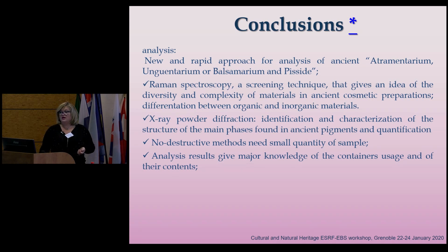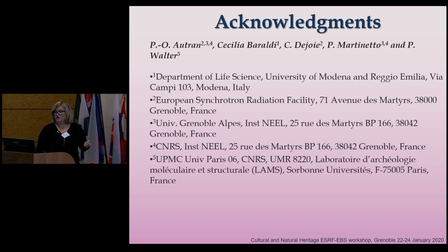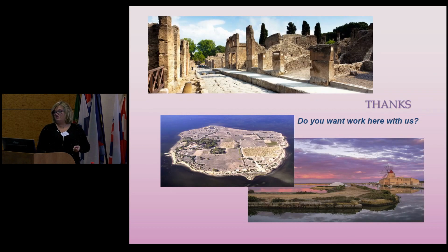These are non-destructive analyses, so the samples can be used for other analyses if we need, and we also have more knowledge about the holders and their containers. I have to acknowledge again all the people still working on the project. Other names are not written here because there were two other persons helping us. So I have to thank again Martinetto and Philippe Baltet, who asked me to come here, and Catherine, who worked a lot, and Pierre Olivier for the XRD pattern diffraction. Thank you a lot for your attention, and do you want to come with me to this marvelous place? Why not?